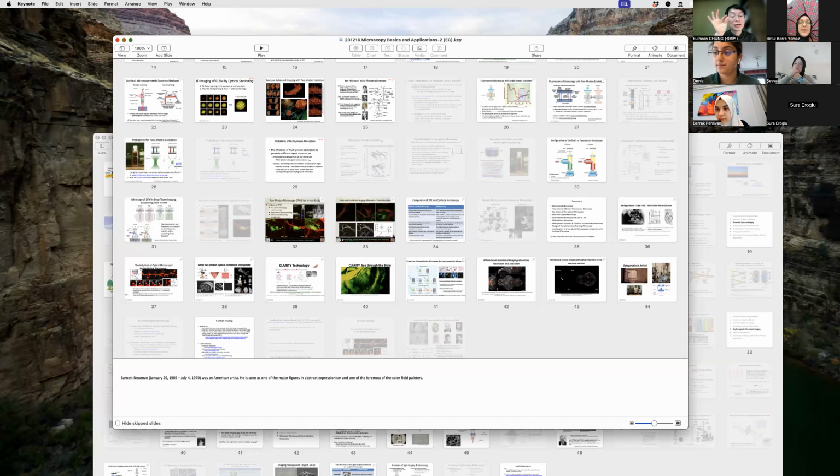And in fact, the shorter the wavelength, in principle, the better resolution we have. So we can make an electron lens, which is an electromagnetic lens, and we use that.